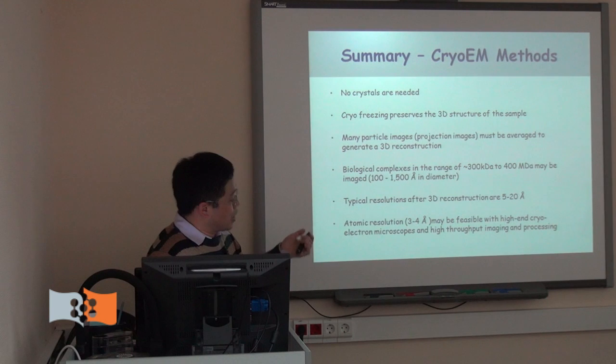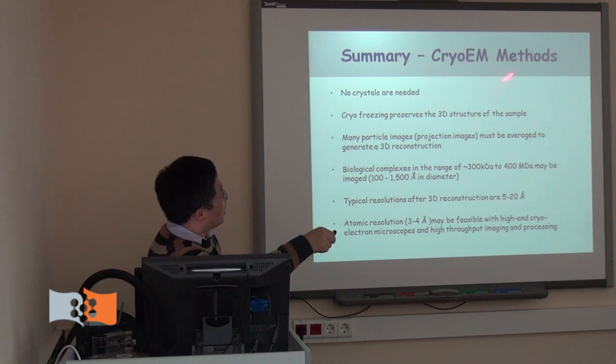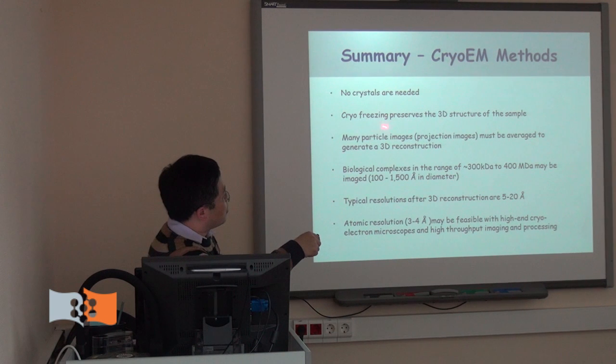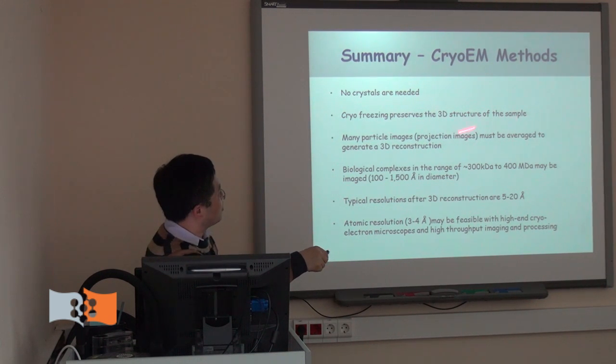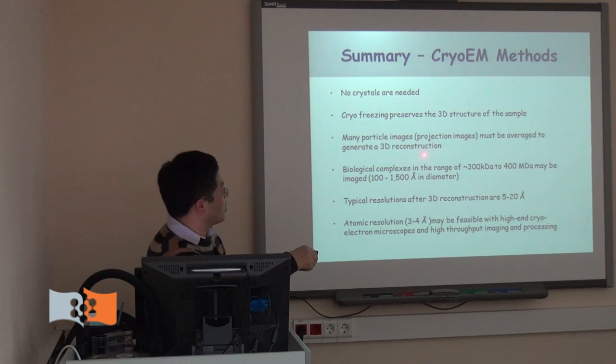So basically, the summary for this session, the whole message, is that for cryo-EM, no crystal is needed, and it can preserve the 3D structure of the sample. You need a lot of particles to do the reconstruction.